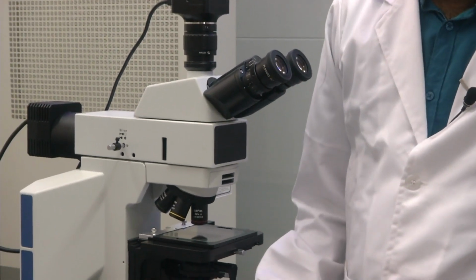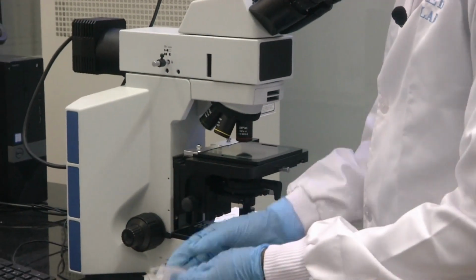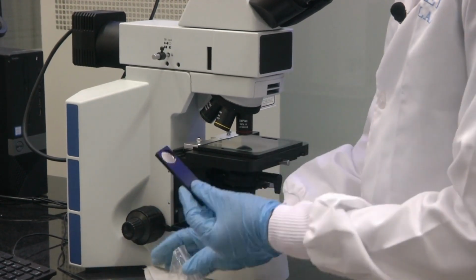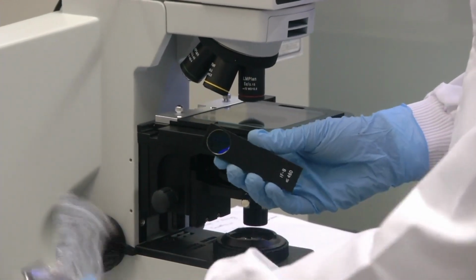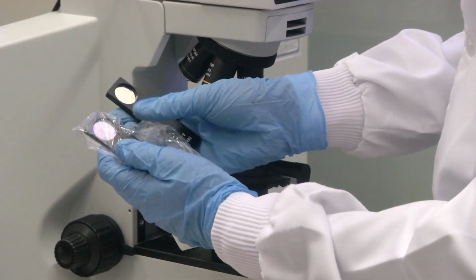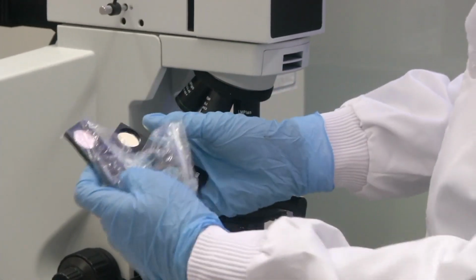So I will show you a few more filters which we are having. Because anyway we came to the filters, we thought we will show you. So let us see, this is a yellow color filter. I don't know, through the camera it might come as a different color, but this is a yellow filter. Likewise we have a blue filter, green filter. So this is blue filter, this is green filter.